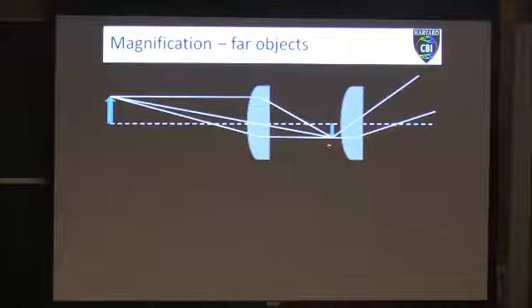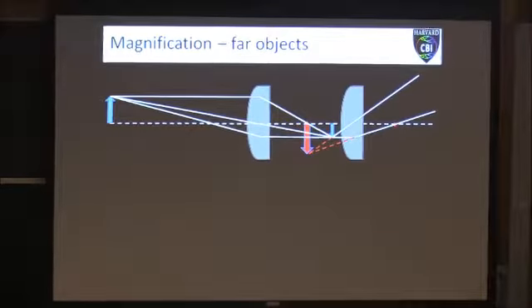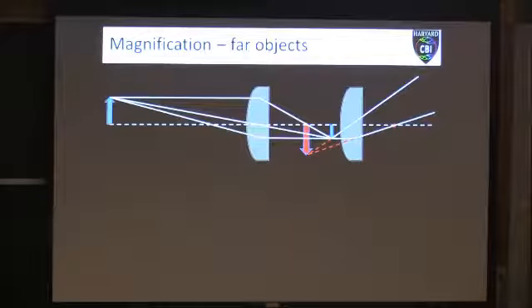Now we have the same situation that I just showed you with the magnifying glass, where we've got rays that are diverging, but we can trace those back to make a virtual image here. All right? Now this is just slightly larger than this. Had I done a better job of drawing this, I can show you how you can actually magnify this quite dramatically. But any idea what type of imaging system works this way?